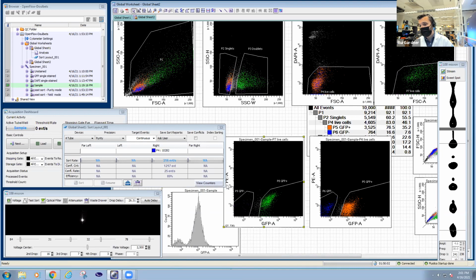Whereas here, when we use autofluorescence, again, I won't go into details, but PE here is not the best parameter. Classically, PE was a good parameter because we were looking at PE excited by the blue laser and looking at the PE emission filter, and that's where you capture a lot of autofluorescence. But now for PE we use the yellow-green laser, which is not as efficient at exciting autofluorescence as the blue laser. Still, it ends up being easier, especially with these diagonals, where we're able to set them in a way that we can exclude and have a bigger gap between these two populations than we would have if we were just sorting based on a histogram.